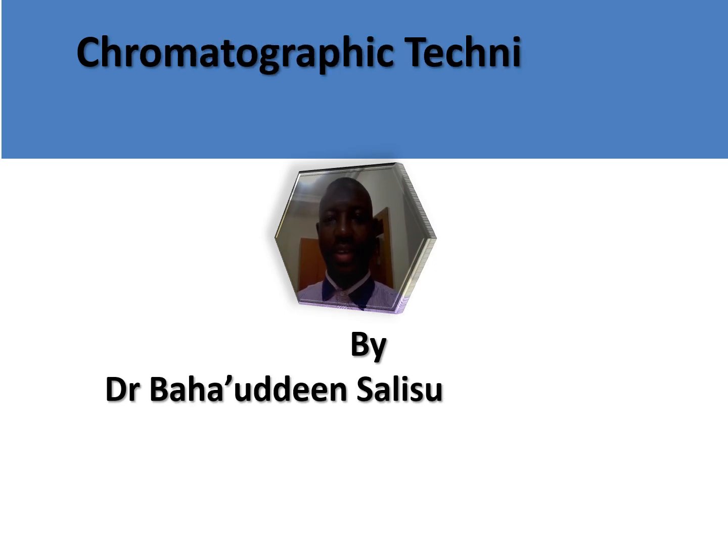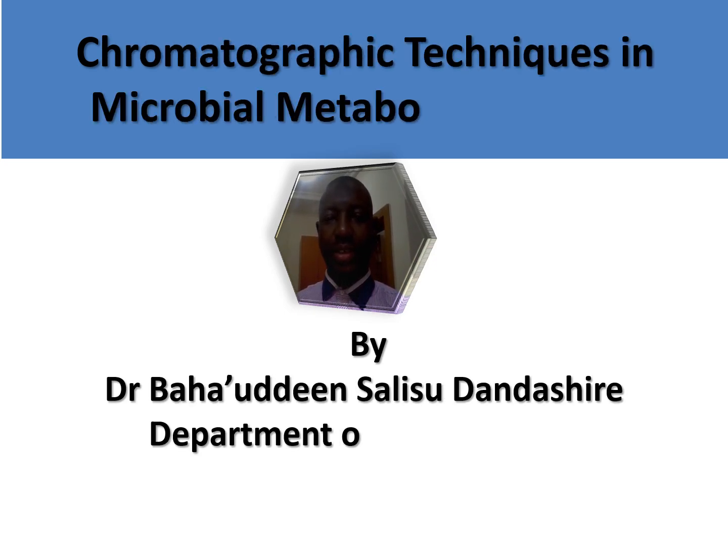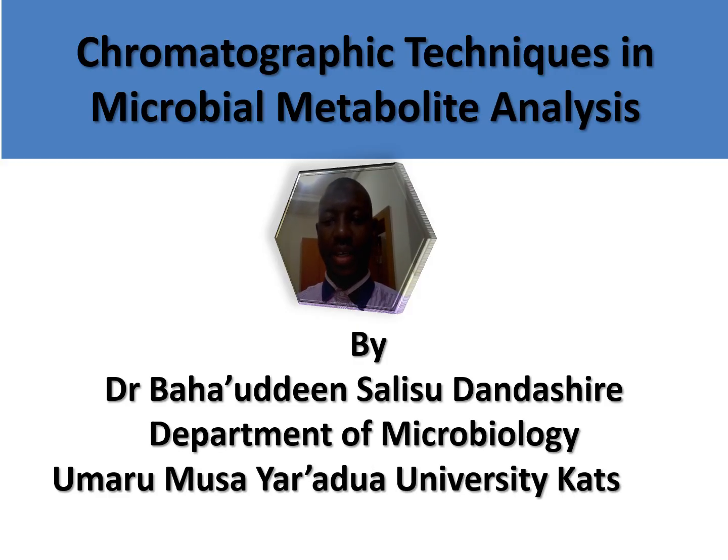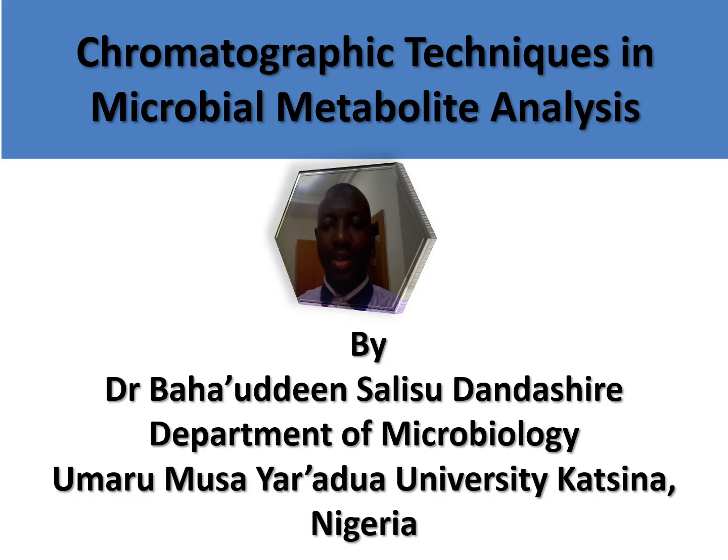The title of today's presentation is Chromatographic Techniques as Applied in Microbial Metabolite Analysis. The purpose of the presentation is to complement the physical classroom lectures so as to serve as a reference for the student.